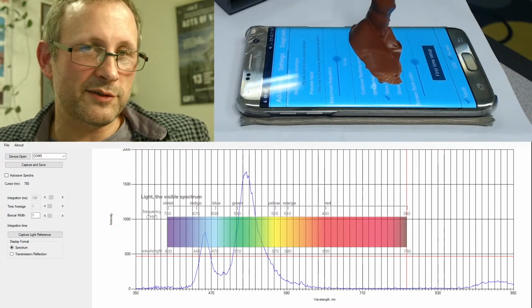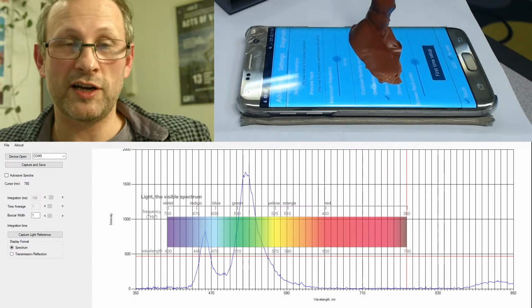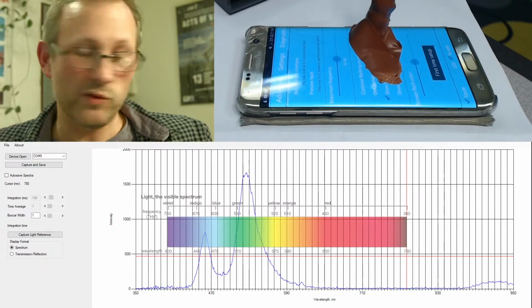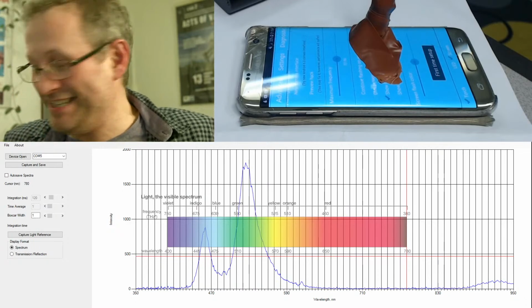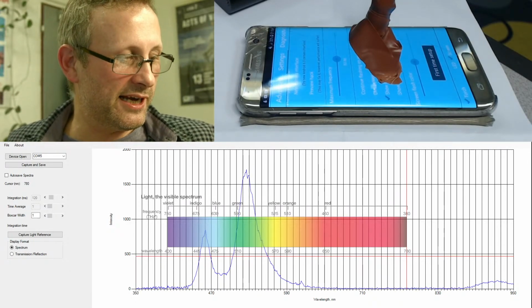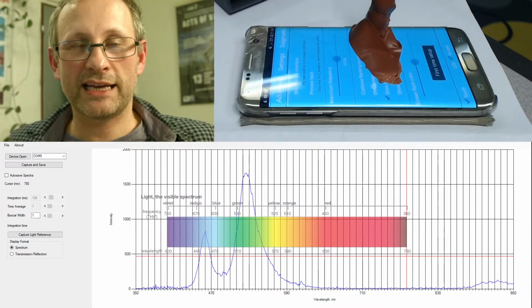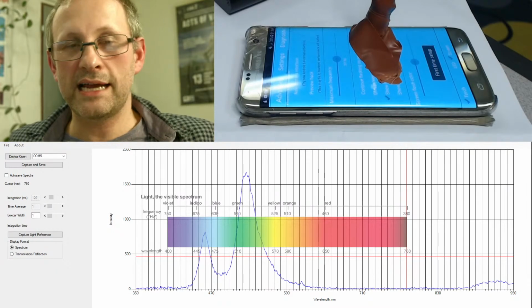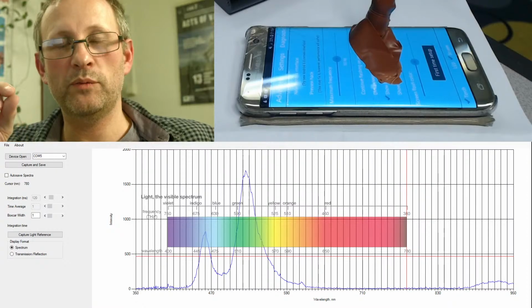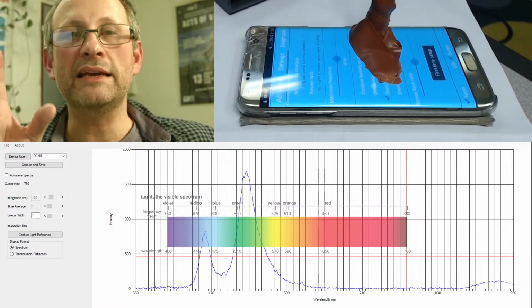Sometimes you just have to have the right tools in the right place, and sometimes it takes a long time to get an experiment together. I wasn't ready to waste my time until I had an understanding of how to shield myself from the radiation, and a way to capture the spectra. It's not always that the data is immediately obvious, what's important in there, but you need to capture it when you do the experiment, and that might give you a clue.